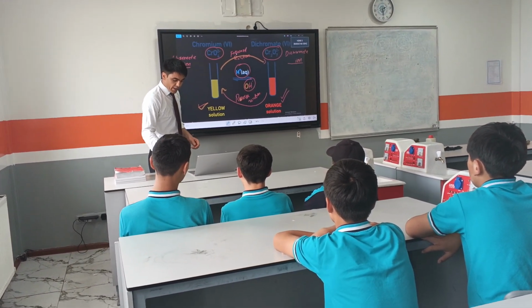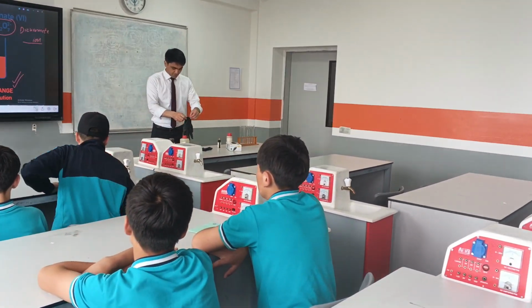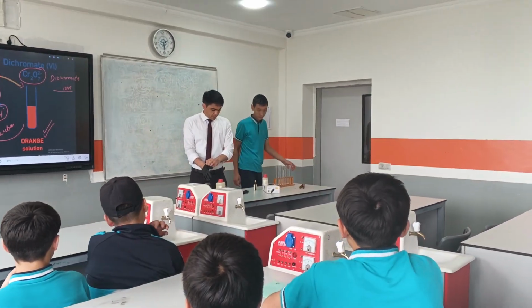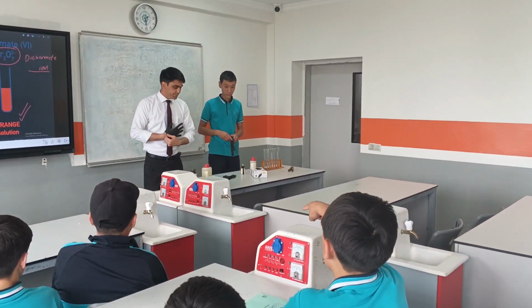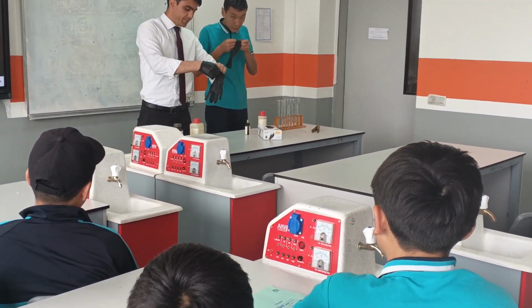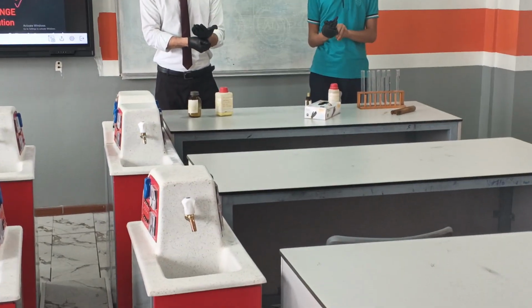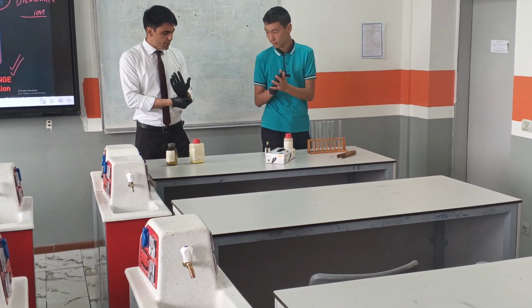So now, let's start the experiment, and then you will see. One of you can come here. Just observe, and then you will conduct it as well, one by one, okay? For this we have to use gloves, because these chemicals are strongly harmful to your skin, your hands. That's why you have to use gloves.